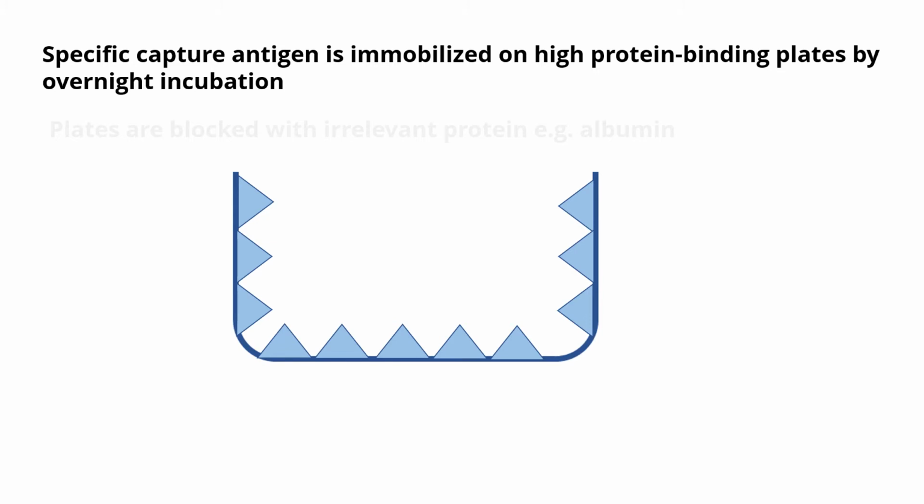But suppose you want to attach antigen, you have to attach antigen on the well and incubate overnight, and on the next day after washing you can use this plate. But because of the advances, the manufacturer provides an antigen coated plate.